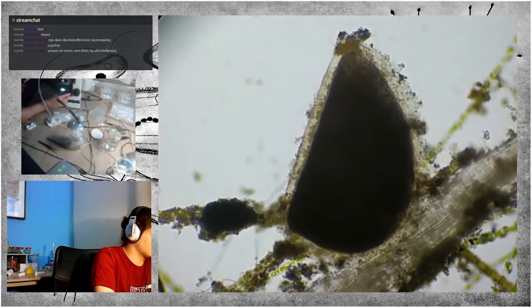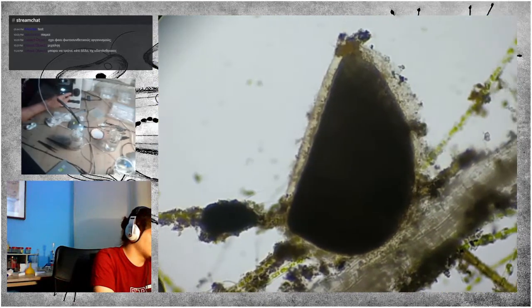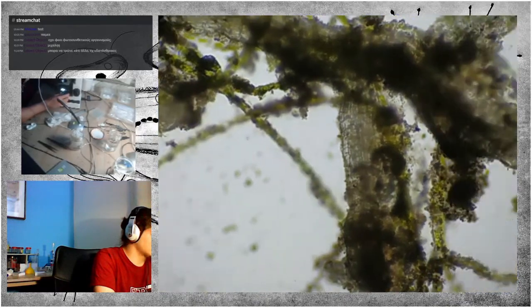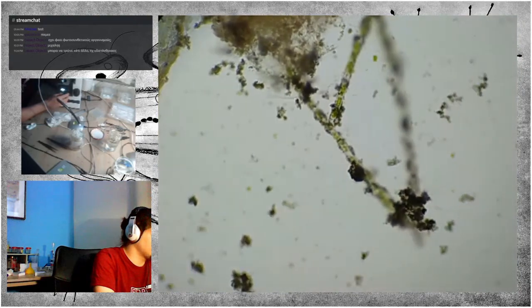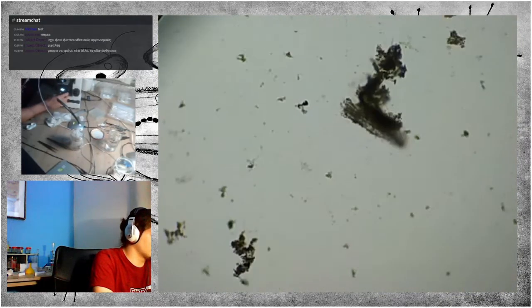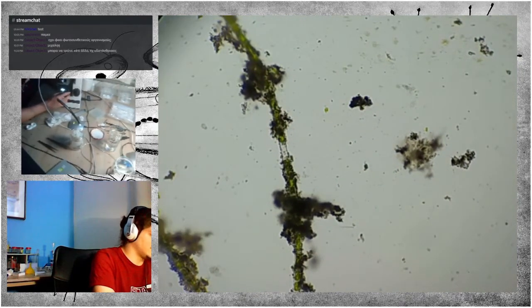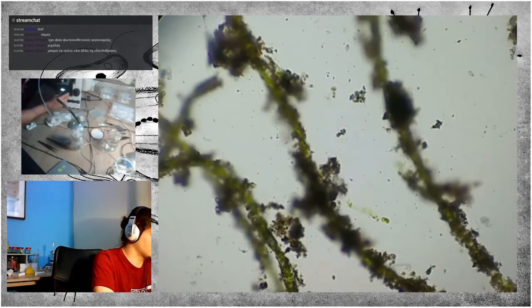This seems like a shell of something, but I don't really know, and I cannot tell because it is completely opaque. And yes, in the sediment you can expect to find worms, nematodes in particular, and also if the water is very shallow, you can expect to find diatoms.